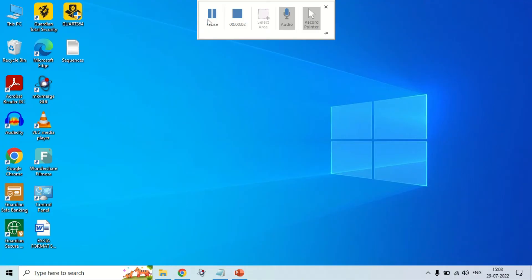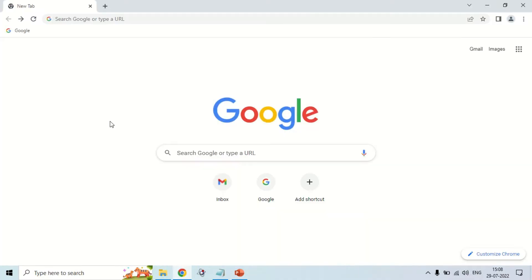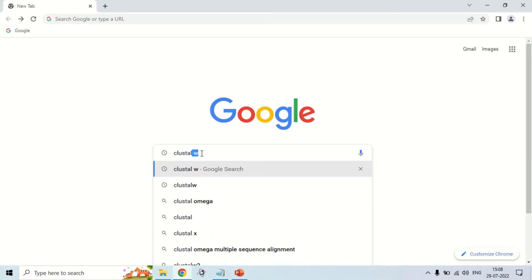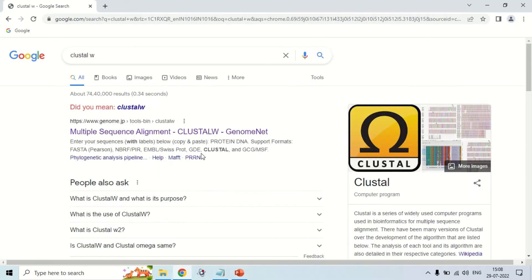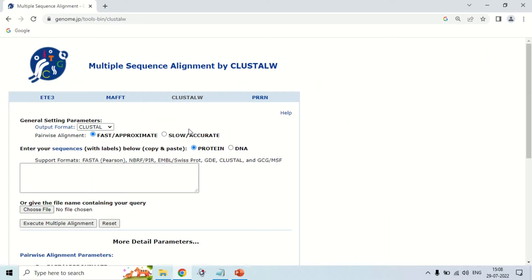This is the computer screen. In order to perform the multiple sequence alignment by using ClustalW, first of all just open your browser. Now just enter ClustalW in Google. The first website that comes up, www.genome.jp, is the site where you can perform ClustalW. Just enter the website by clicking here. This is the home page of ClustalW.